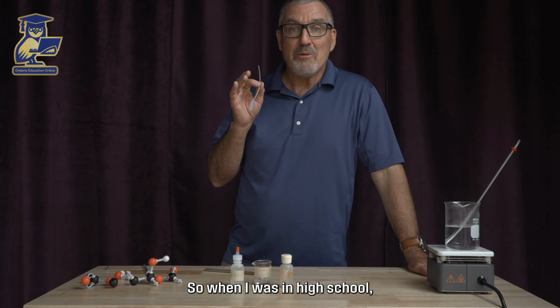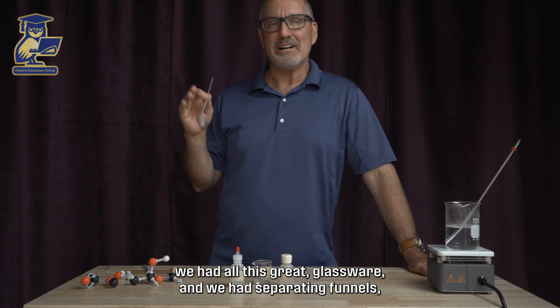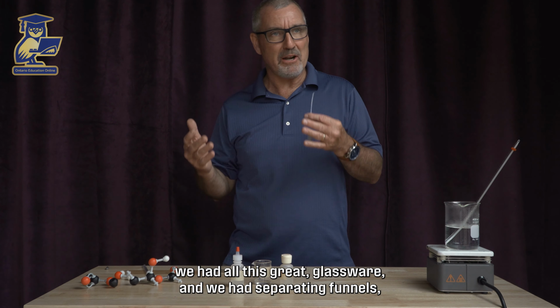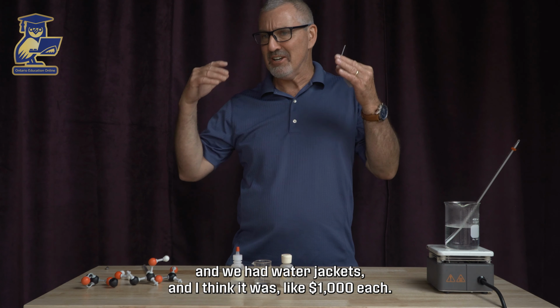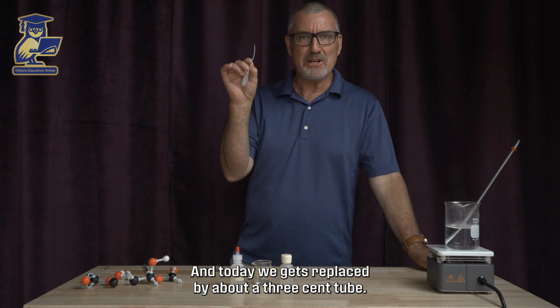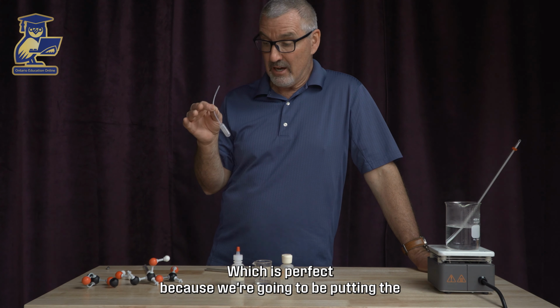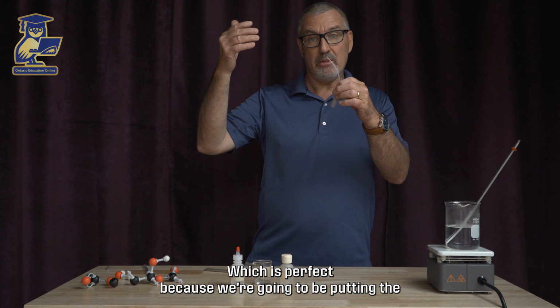When I was in high school, we had all this great glassware, and we had separating funnels, and water jackets, and I think it was like $1,000 each. And today we get replaced by about a 3-cent tube, which is perfect, because we're going to be putting in, and the order is important here, carboxylic acid in first.